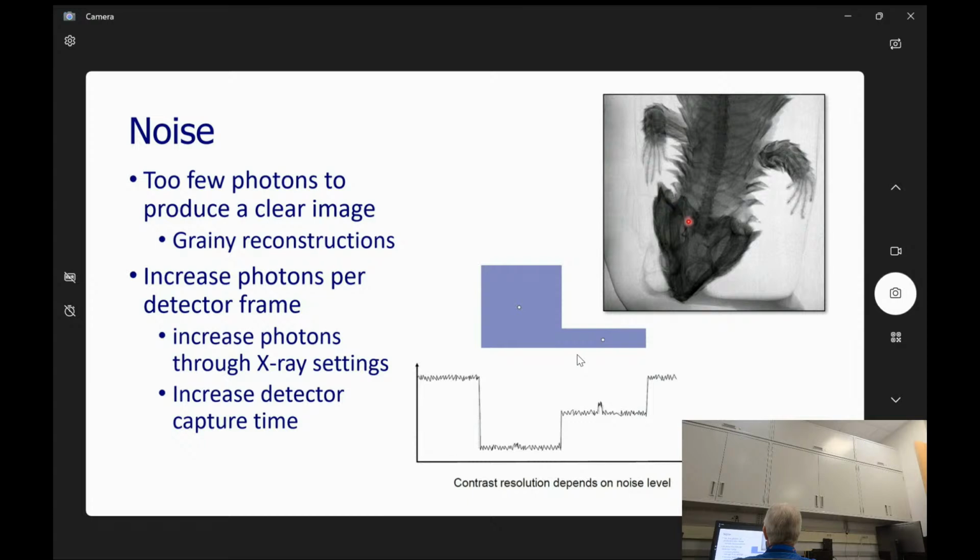Now, if I want to segment something that's really noisy, I have 3D pathways of grayscale values that basically merge. So instead of doing everything automatically with clear definitions, I'm doing things manually by basically drawing in 3D.